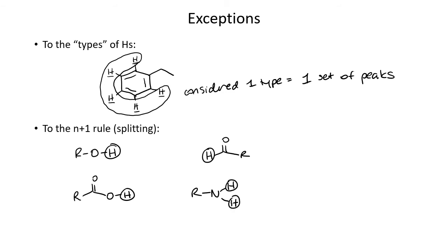So these peaks will always appear as one peak. They will have no splitting. So we do not look at the neighboring rule with these types of hydrogens.